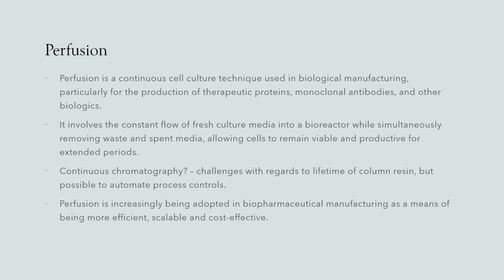You do need to qualify this, and you need to look at the stability of your cells and justify this from a scientific perspective as well as from a risk perspective. But it reduces your downtime as well, so you don't need to do so much setting up of the process or cleaning between batches. So it's effective in terms of your operational management. And you can integrate some downstream processing.